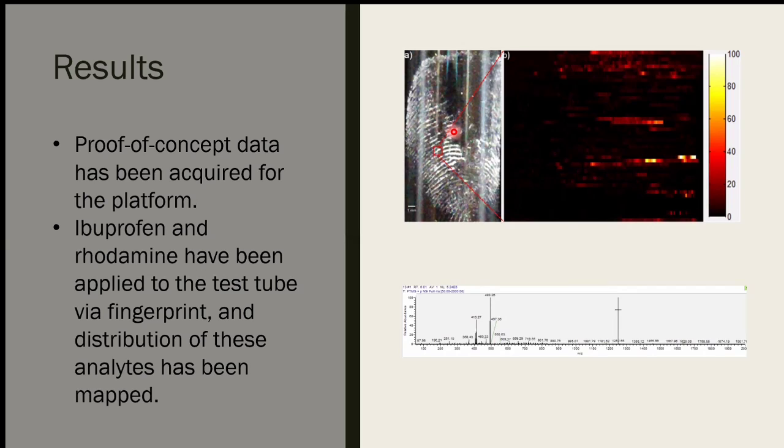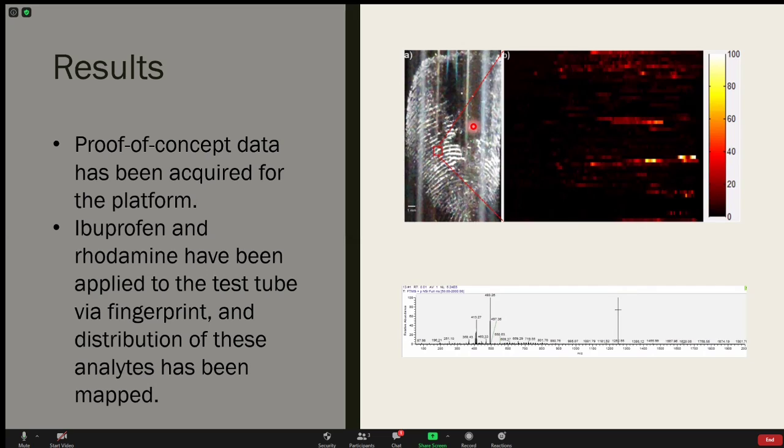Yeah, I did about 50 lines on that one, and it felt like it took a while, though I also left for part of it. There's not much I can do once it starts. But then it's going to take significantly longer, though we're using an orbitrap right now, and we're going to switch to using an ion trap so that we can do faster scanning and allow the probe to cover a larger surface while still maintaining a fair amount of signal stability.